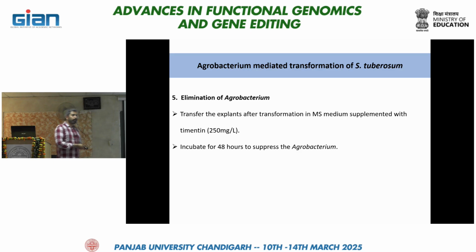You can also use cefotaxime. Both of them are broad spectrum antibiotics, and the concentration we have used here is 250 mg per liter. After washing with this medium, you can simply incubate your explants to suppress the agrobacterium.